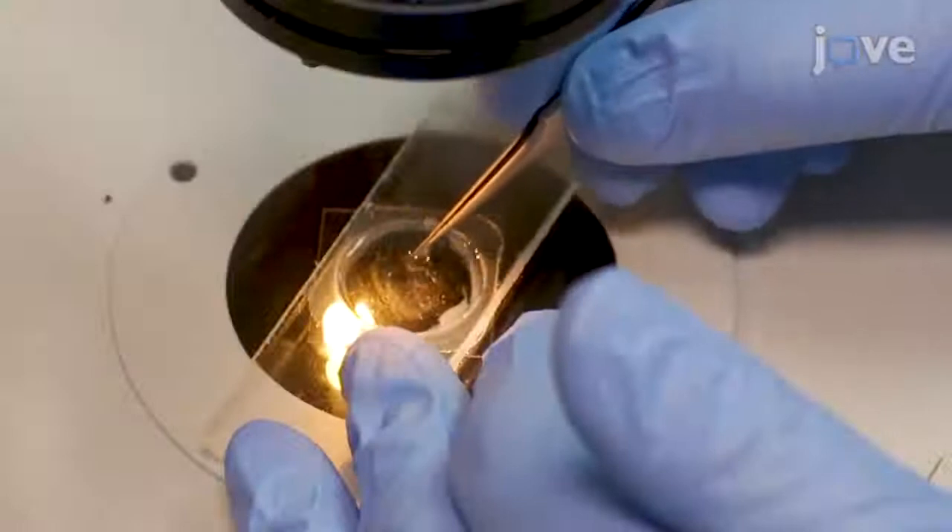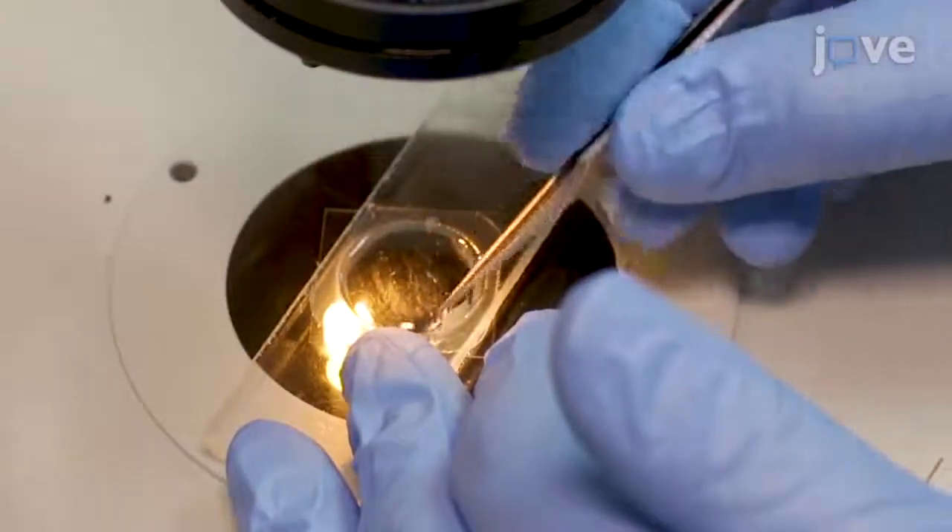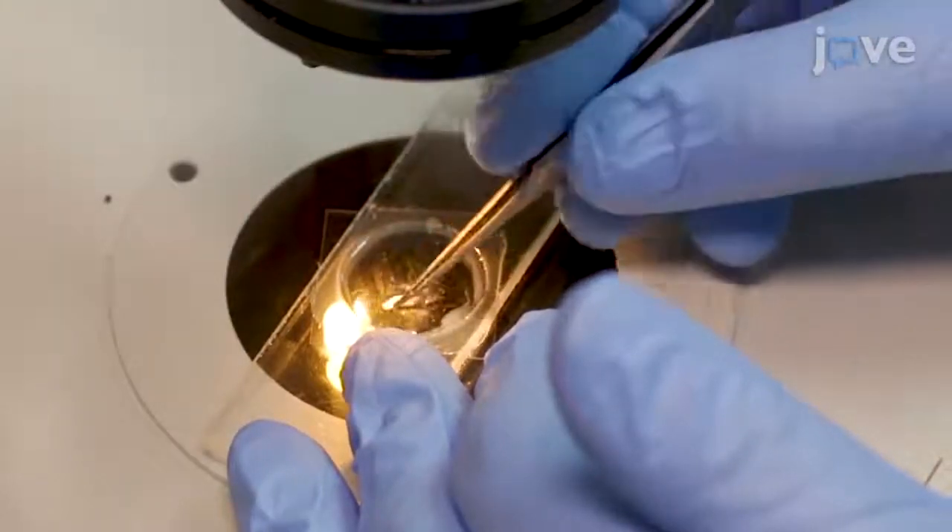Under the dissecting microscope, use fine-pointed forceps to divide the testes into smaller pieces and remove any fat. Then, spread the contents of the testes under the oil on the surface of the coverslip. Continue to spread the contents of the testes until the spread portion is barely visible to the naked eye.